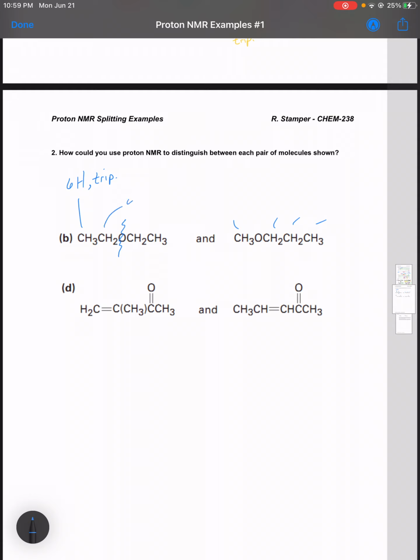And I'd expect a 4 hydrogen peak that would be split into a quartet because the CH2 has 3 neighboring hydrogens. So 2 signals, a triplet, and a quartet. I'm not going to try to predict delta numbers here, but I would predict that the triplet would be closer to 0 because it's further away from the oxygen. The quartet signal should be shifted a bit more.